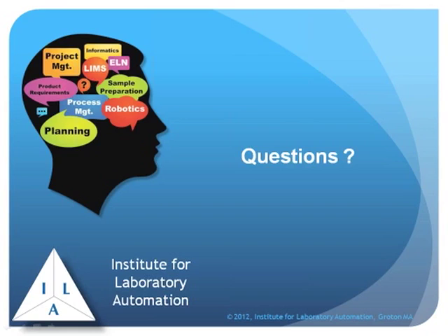Okay. The next question is, what are the major challenges to setting up a fully automated system? The biggest challenges are space and flexibility. If you think about it, if you were to automate every piece of equipment or every process in your laboratory, you need a huge lab. If things are being done manually, on a given day you pick up one piece of equipment, you set it up on the lab bench and you work it and you put it away. When you're done, the next day that same space on the lab bench is used for something else.